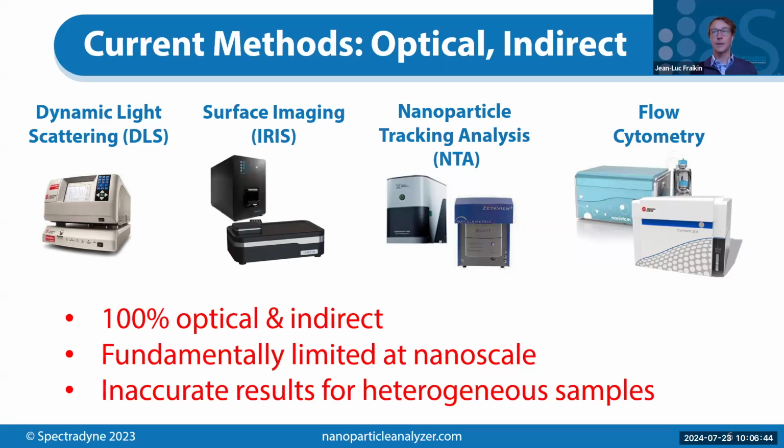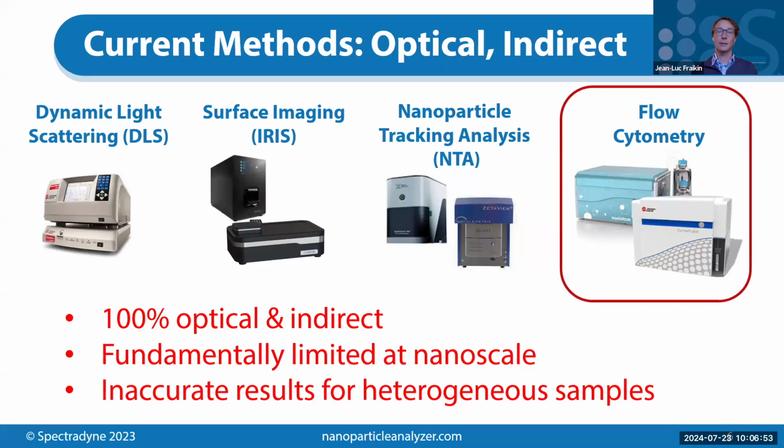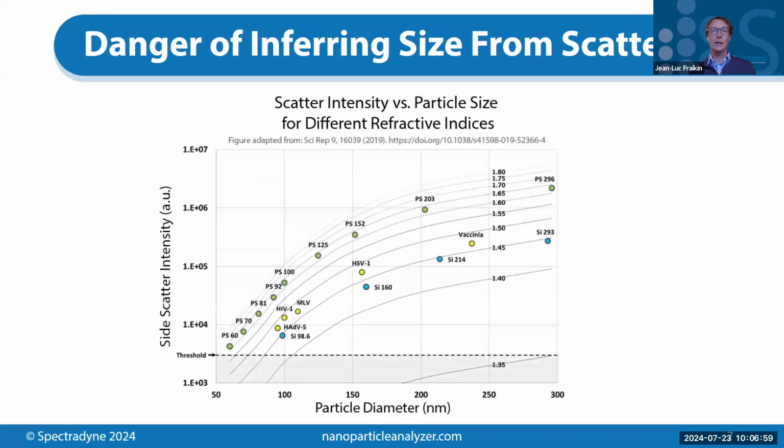these samples. I'd like to show an example of that using flow cytometry, because this is increasingly used for nanoparticle analysis and for vesicles as well. So this figure that I'm showing here is from a paper in 2019. It's from Beckman-Coulter, actually, when they developed the CytoFLEX.